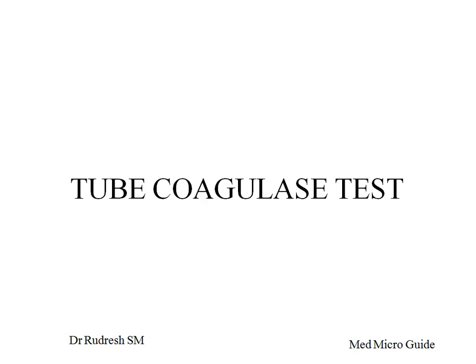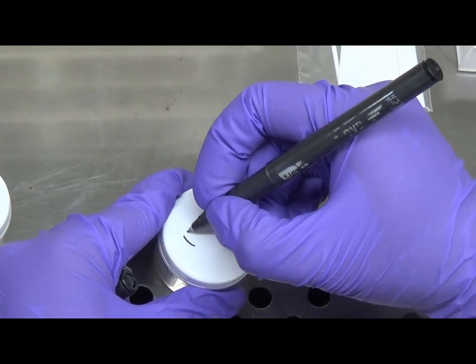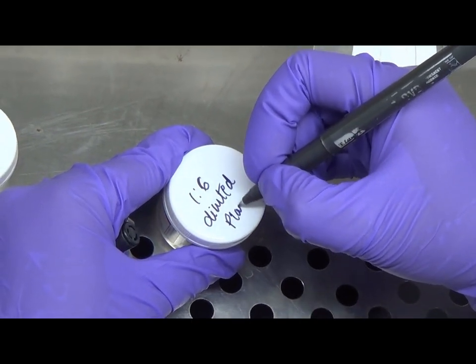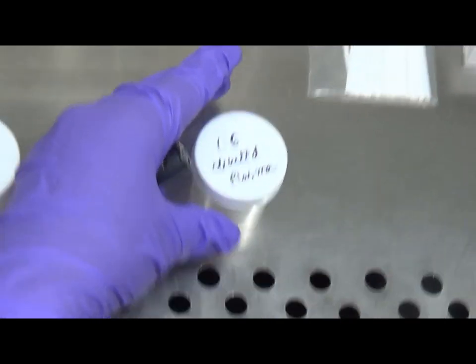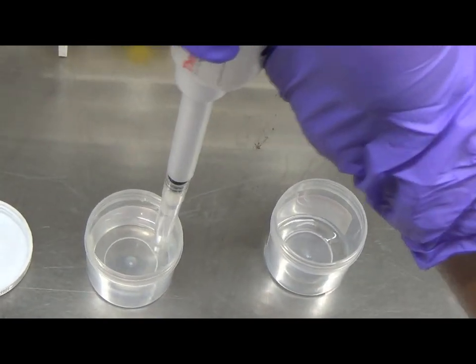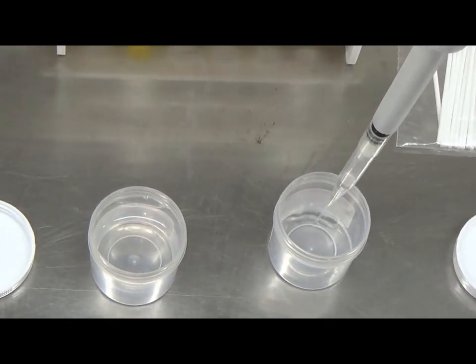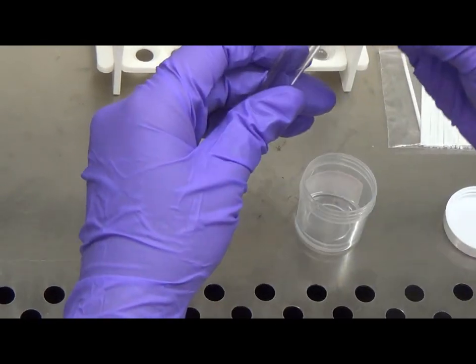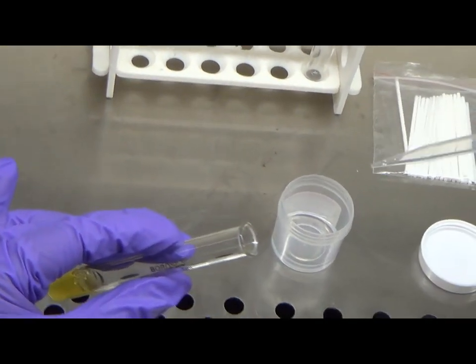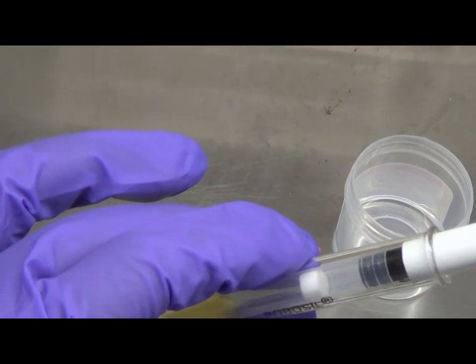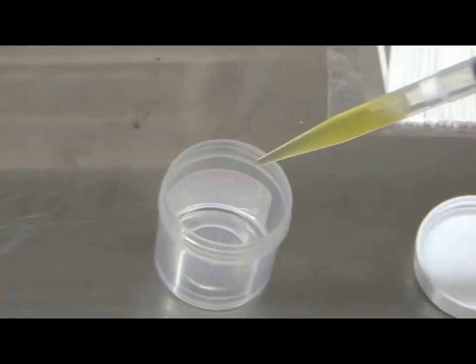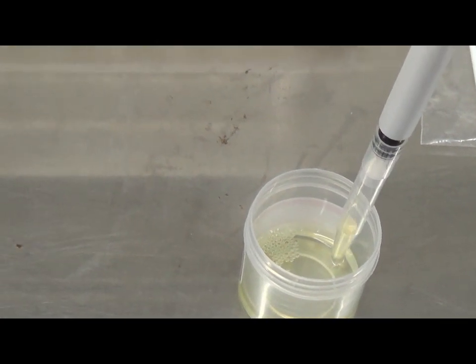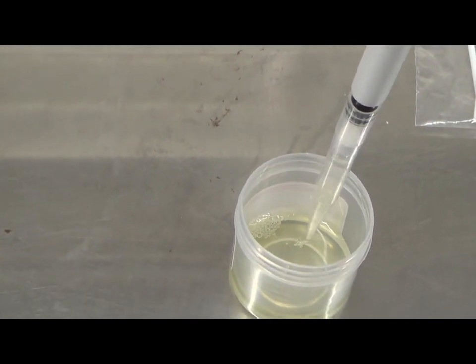Now we will see how to do the tube coagulase test. First, we will prepare the diluted plasma. Take a sterile universal container and label it as 1 in 6 diluted plasma. Add 5 ml of sterile normal saline to the container. To this 5 ml of saline, add 1 ml of pooled human plasma. Adding 1 ml of pooled plasma to 5 ml of saline gives a final dilution of 1 in 6. This freshly prepared plasma can be kept in the refrigerator for 2 to 3 days.